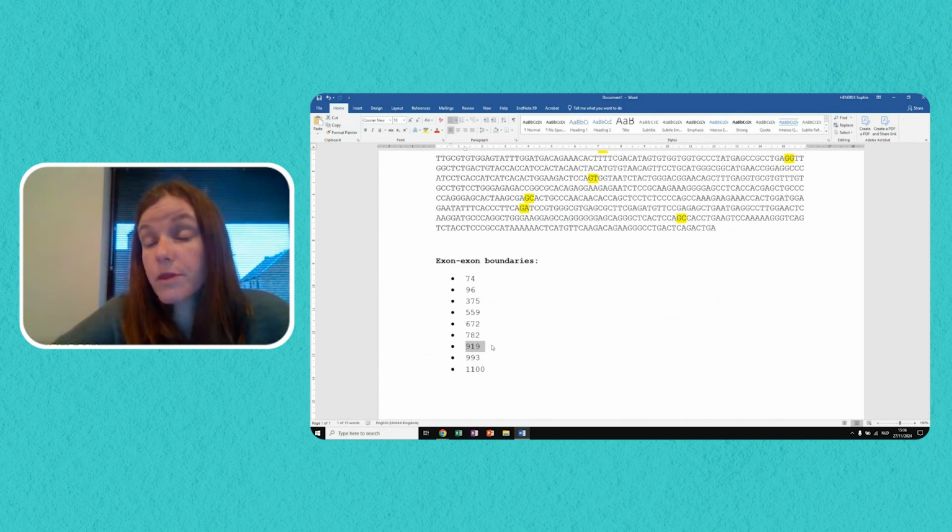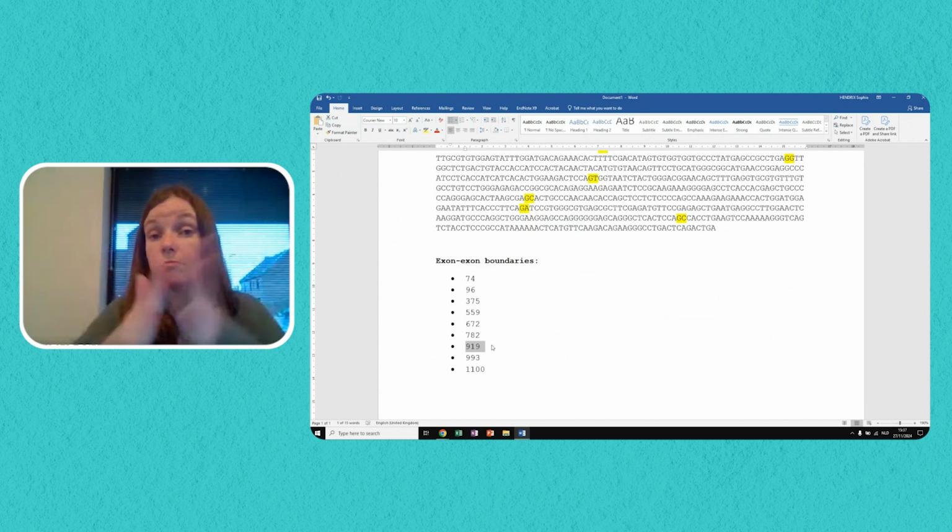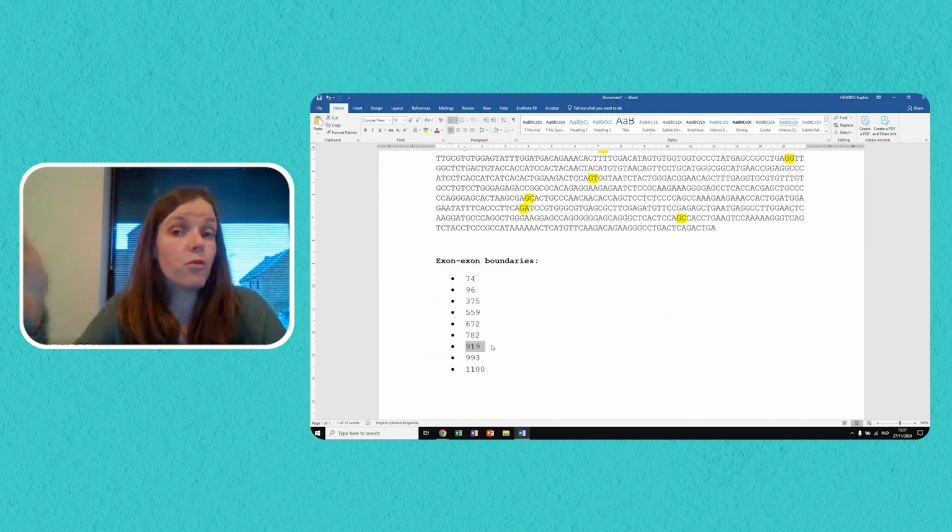And this is something we would like for the primers, because this reduces the likelihood that these primers would also be able to amplify genomic DNA. The primers would still be able to bind to genomic DNA. However, in genomic DNA, there would be an intron in between the two exons where each of the primers bind. And because this intron likely is rather long, the amplicon size would become so long that in a qPCR cycle, there is insufficient time to amplify a product from genomic DNA.